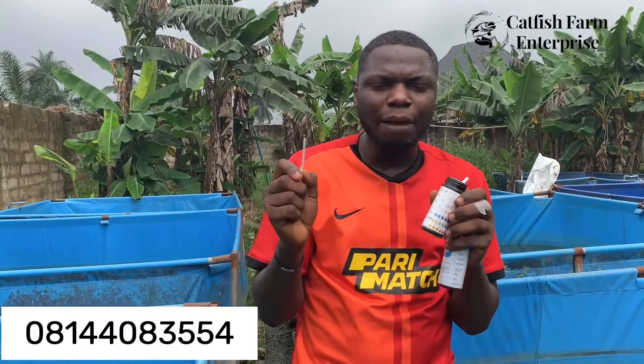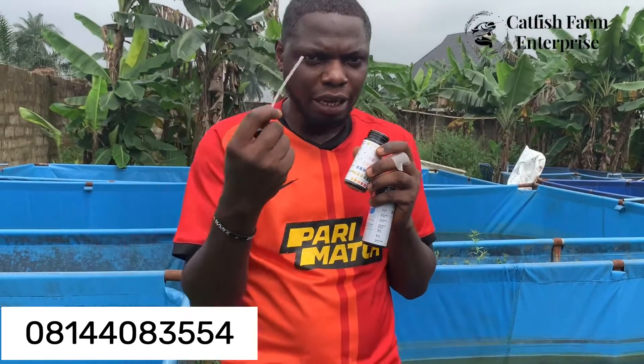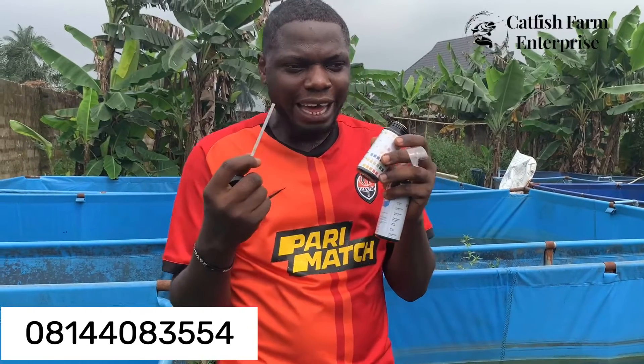That means the water we have is okay for use in training the catfish. You can use these simple kits to test your water to ensure it is okay to breed the catfish, enabling faster growth for your fish in the pond. Do reach us on the number on the screen — we can distribute nationwide to anywhere you are in the world.